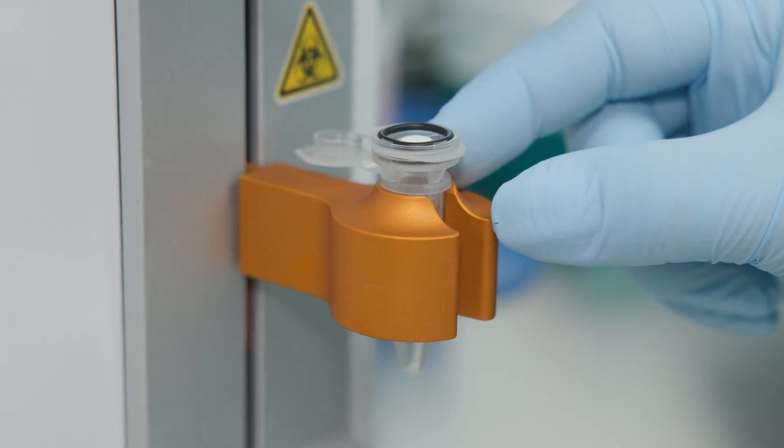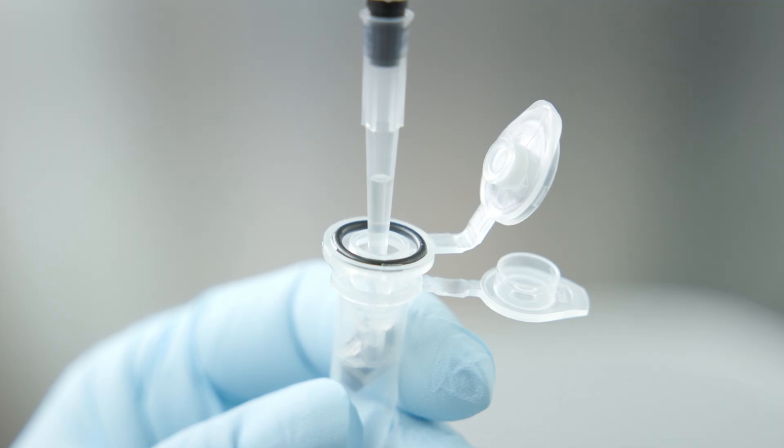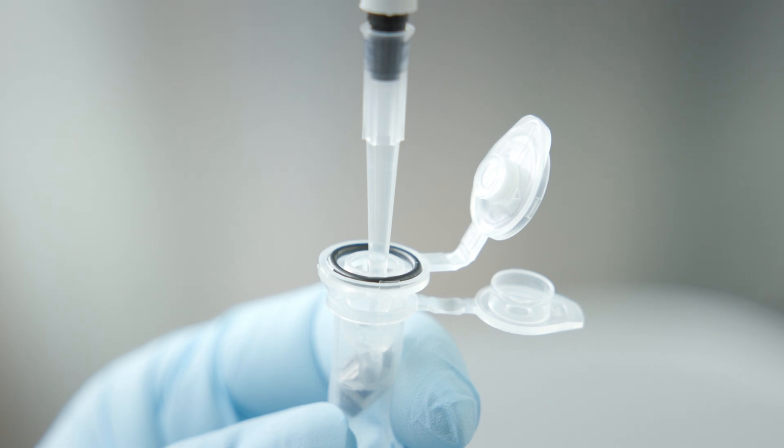The simplicity lies within the CellPore delivery cartridge. First, a mixture of cells and cargo is loaded into the cartridge's reservoir.